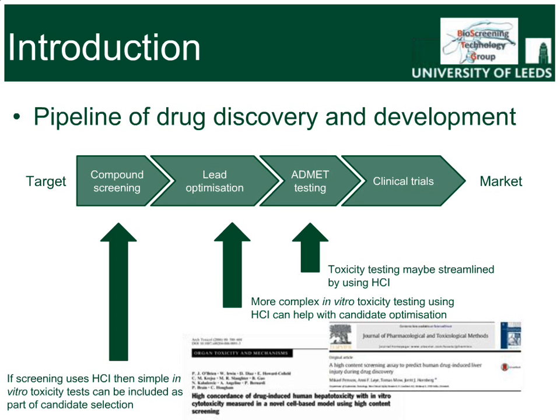However, these assays are designed solely for toxicity detection, utilizing all available imaging channels in the systems used. And whilst they should reduce the number of compounds that fail in vivo ADMET studies, as well as streamlining the testing procedure, they do not fully address very early compound failure. This type of assay is indeed relevant at the points indicated by the two rightmost arrows on the diagram. And as I've just said, there's an opportunity to use high-content imaging to reduce compound failure earlier by screening with initial screening for active compounds, as shown by the leftmost arrow.